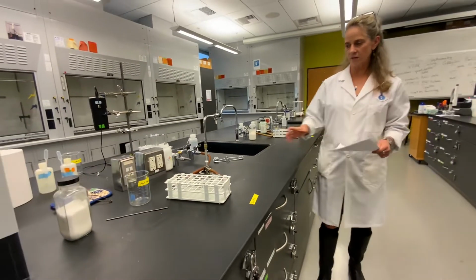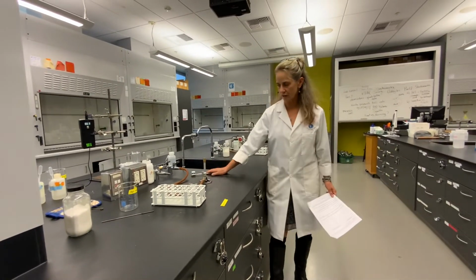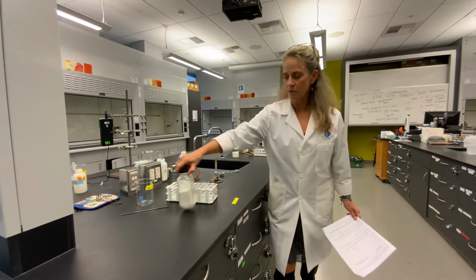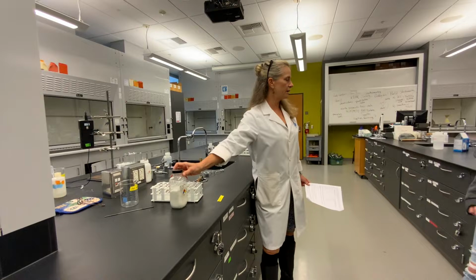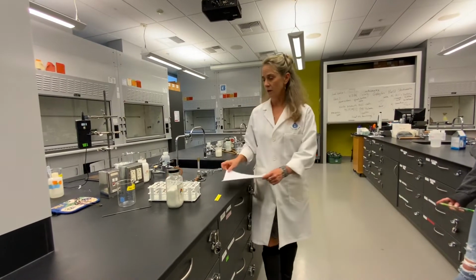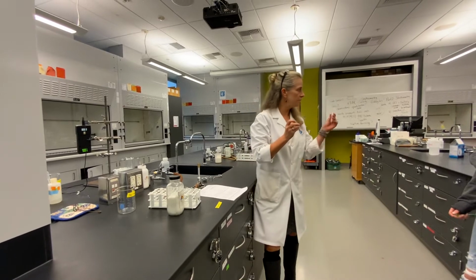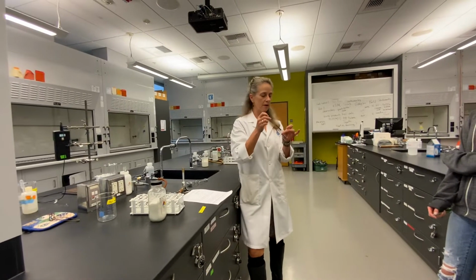Reaction number 3, repeat, Bunsen burner, striker, right? Okay, you're going to use sucrose this time. Remember, that's a disaccharide we talked about in our biomolecule part. You're going to use this little spatula this time and a little tiny test tube. Scoop up a bit, put it in here. It won't be very much.